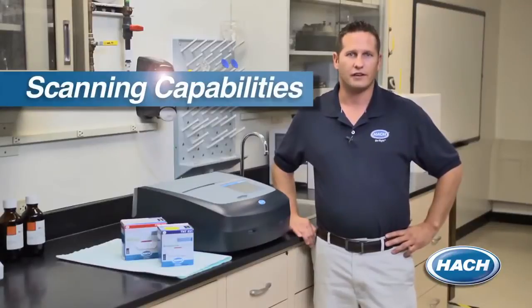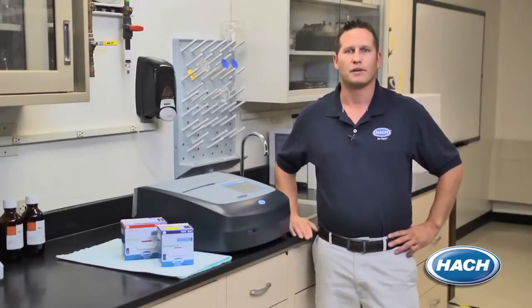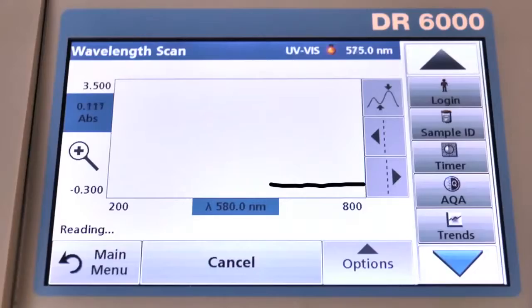One of the greatest benefits that the DR6000 can offer is the flexibility to run both ultraviolet and visible wavelength methods. The UV capability allows you to run compliance methods like UV organics and UV nitrate to help optimize your treatment systems. Also, high-speed wavelength scanning across UV and visible wavelengths allows you to develop and save your own custom methods for your specific parameters of interest, so they can be easily repeated.